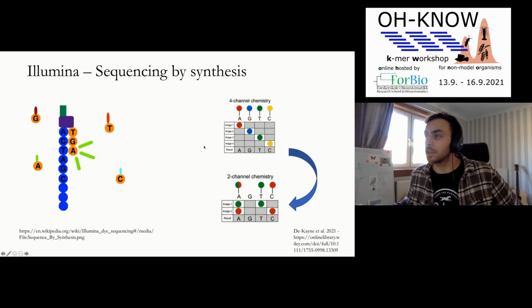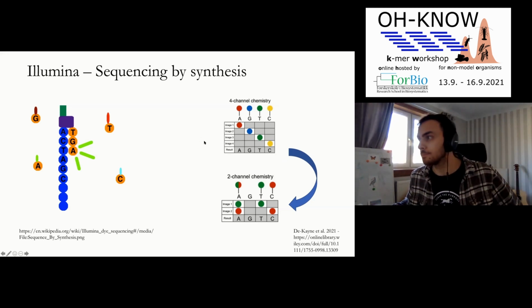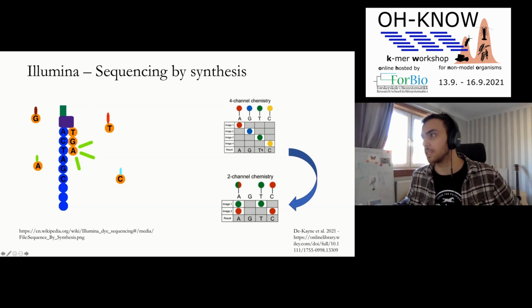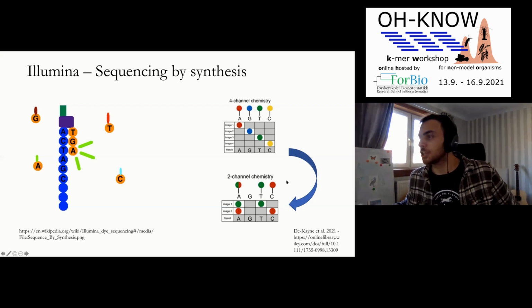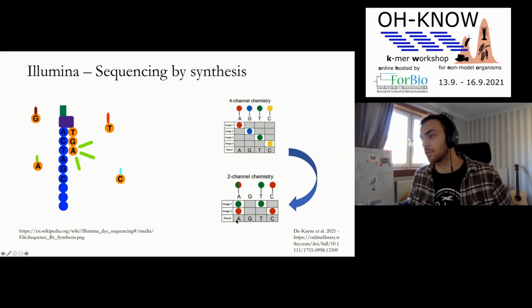In previous iterations of Illumina technology, things like MiSeq, I think, and NextSeq maybe, they use this 4-channel chemistry where each nucleotide has its own color. So in this example, A's are red, G's are blue, T's are green, and C's are yellow. And that's great. Until they decided that to save money and throughput, they could change to this 2-channel chemistry where different combinations of light confer nucleotides. So A is signified by green and red being emitted, T by green, C by red, and G by no emitted light.